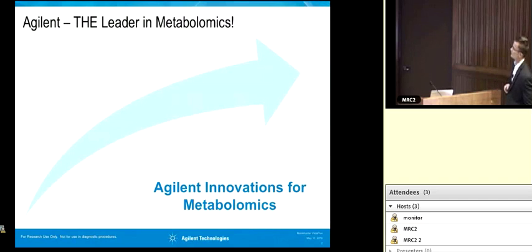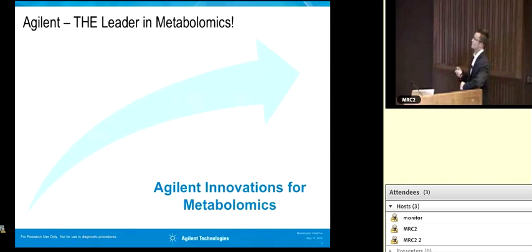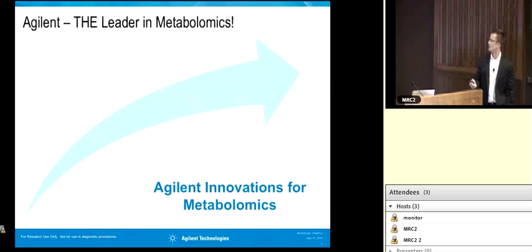So this is going to allow us to say, we can feed in this case, this is fumarate. It's a C4 metabolite, and you can see at 0 hours, we're at natural abundance, right? So we have 99% C12 and 1% C13. If we incubate for 8 hours in fully labeled C13 glucose, we can see that the profile changes quite readily. We've put across a naming convention here that hopefully I'll get across right now. Consider the natural abundance as your N+0. So you're going to have no C13 and 4 C12s, all the way up through, in this case, N+4, which would represent full incorporation of 4 C13 atoms into fumarate after 8 hours. Does that make sense? Should be pretty straightforward.